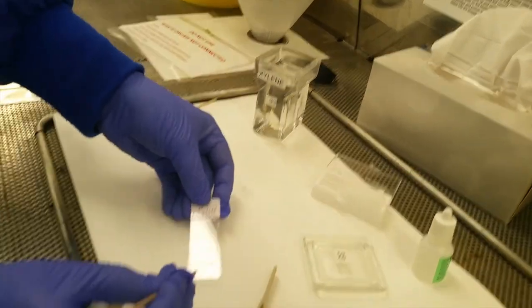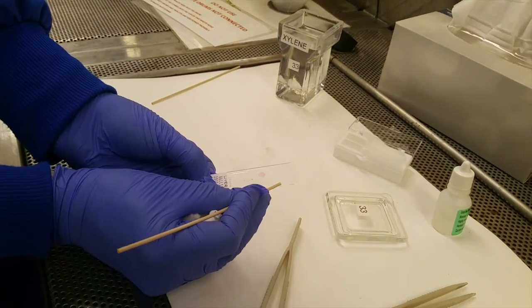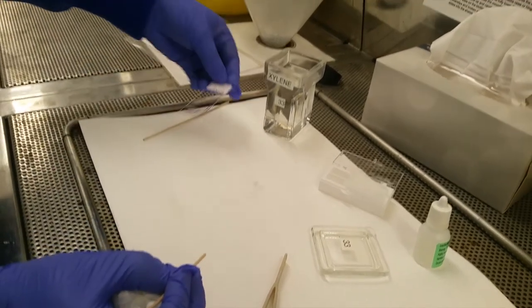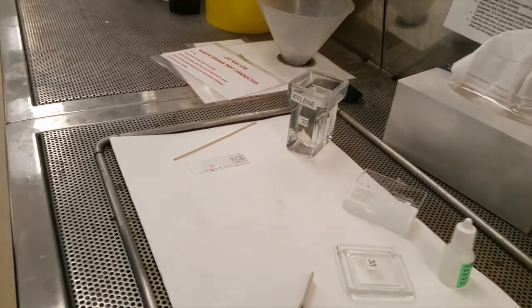Now that bubble was nowhere near the specimen, but it's just to demonstrate that technique in case you need to do it. Then make a final adjustment, making sure it's on straight, and then laying it flat, and just let that dry.